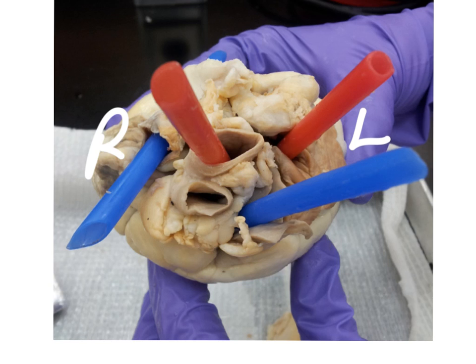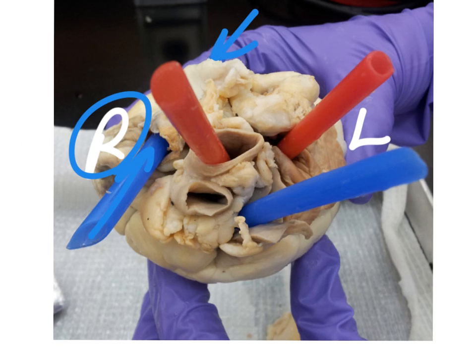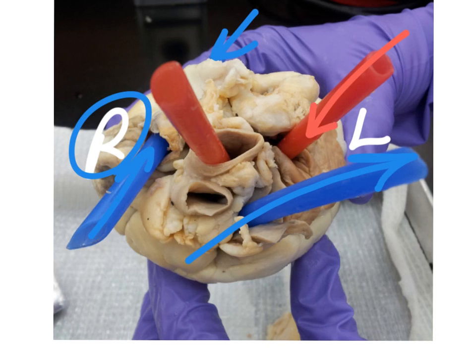Here is a superior view looking at all of the vessels. Let's follow the path of blood: it is going to come from the superior and inferior vena cavas into the right atrium, go to the right ventricle, then be pumped out the pulmonary trunk to the lungs. Oxygenated blood then returns from the lungs via the pulmonary vein, goes to the left atria, left ventricle, and then is pumped out the aorta — this is just a major branch of the aorta.